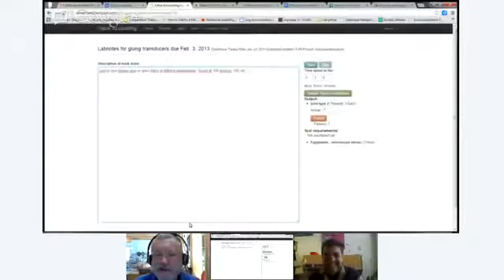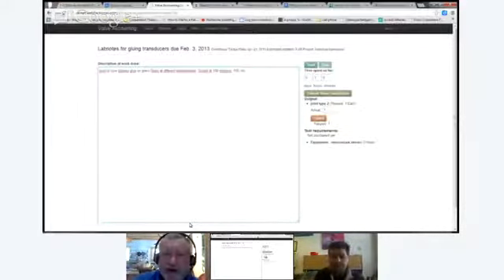All right. And if you hit a system error, the system does send me an email with all of the details. So most of the time you don't have to tell me what happened. I will know, but still tell me anyway. Okay. Just complain.